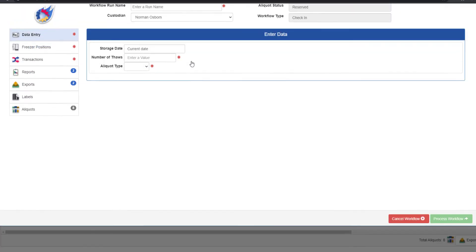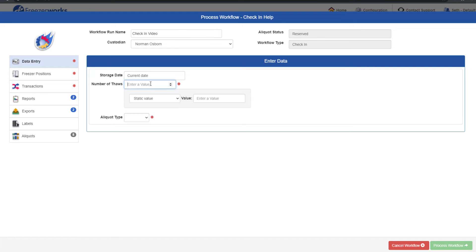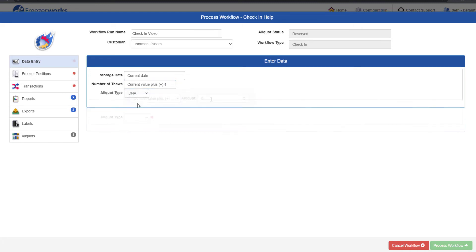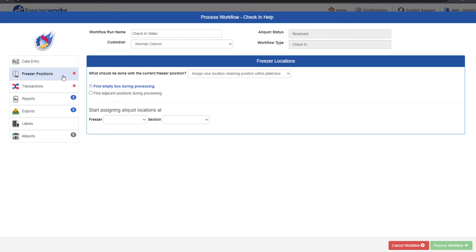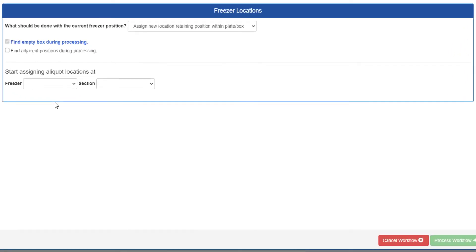The process workflow form for a check-in is essentially identical to checkout. Look for the asterisks to see what tasks are required by the workflow and complete them. You may have one on the freezer positions page this time, as I do. Let's go there now. When we're checking in aliquots, this typically means we're putting them into a freezer, making this page very important. As you can see, this is where check-ins differ from check-outs.